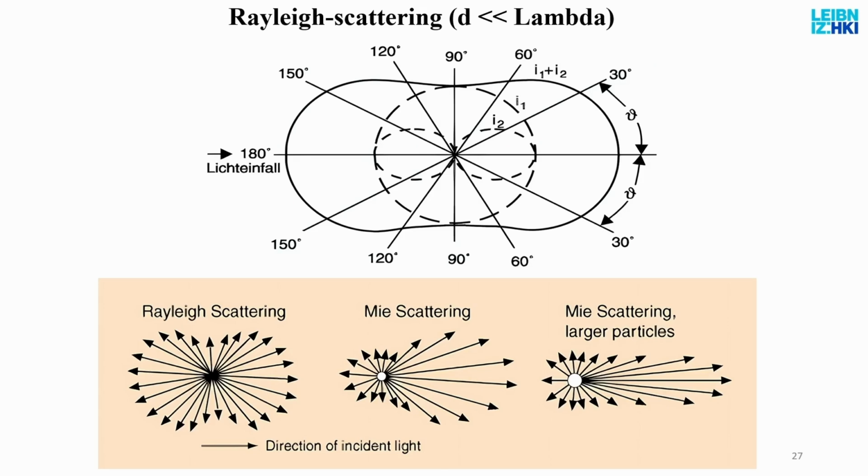But there is a mathematical formula, the so-called Zernike polynomials, that describe all of these aberrations mathematically, which means that in an iterative method you can try to estimate how much of these four problems you have in your image, and iteratively try to compensate for them. And it's possible, like I said, because there is a formula that describes all these aberrations.